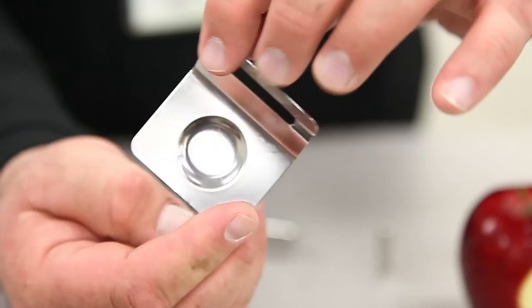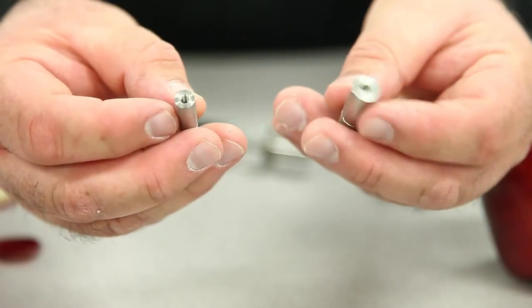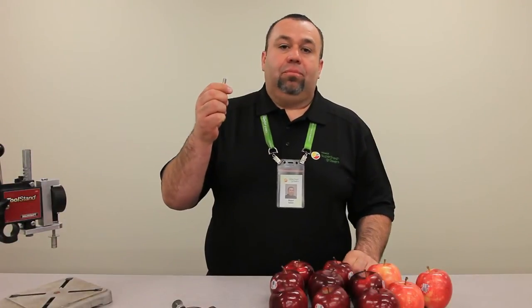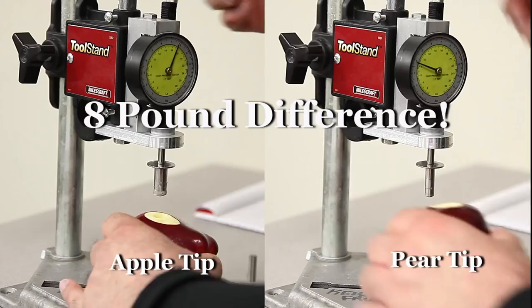The best fruit peelers are made in Italy and cost between $20 and $30 each. There are different tips available for pressure testers — be sure to use the bigger one for testing apples and the smaller one for testing pears. Using the small tip when pressure testing apples will give you readings that are 5 to 10 pounds lower.